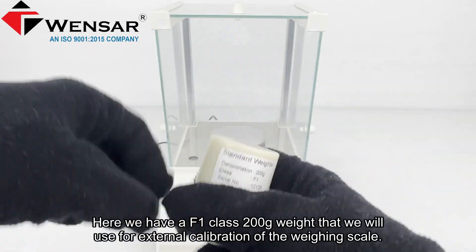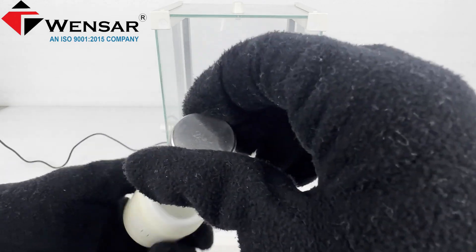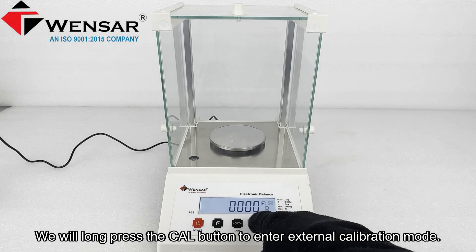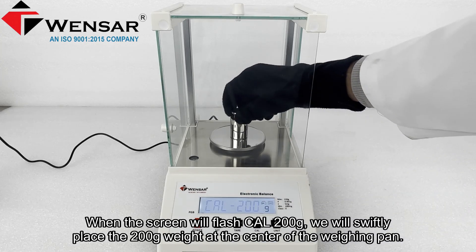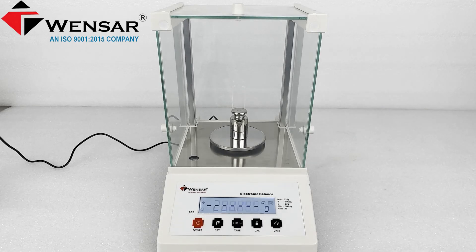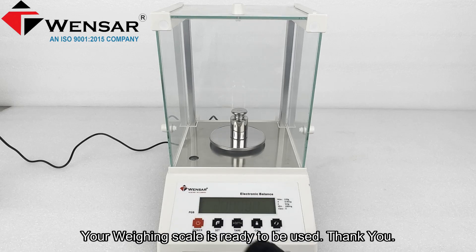Here we have an F1 class 200 gram weight that we will use for external calibration of the weighing scale. We will long press the cal button to enter external calibration mode. When the screen flashes 'CAL 200g', we will swiftly place the 200 gram weight at the center of the weighing pan. After a little while the weighing scale will be calibrated, and your weighing scale is ready to be used.